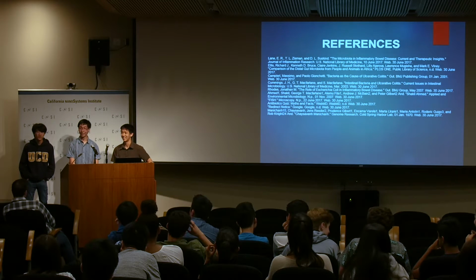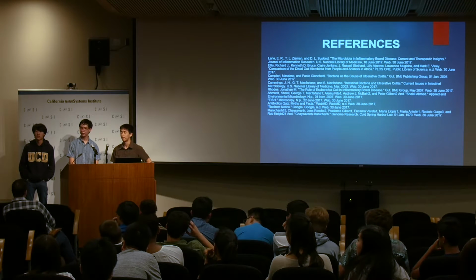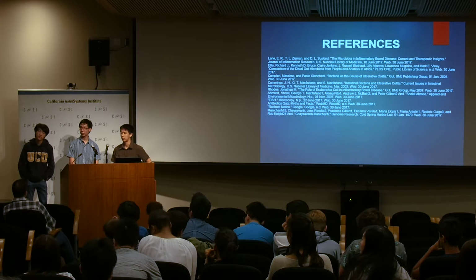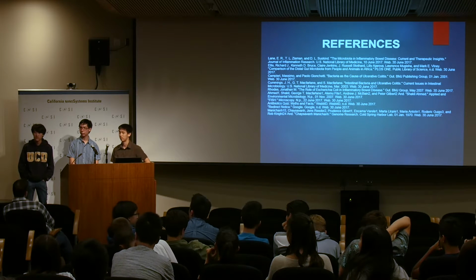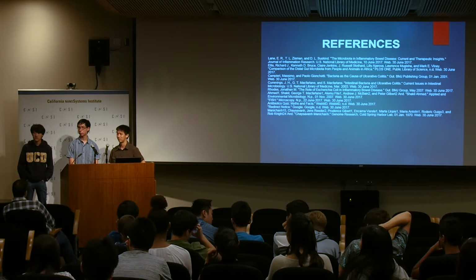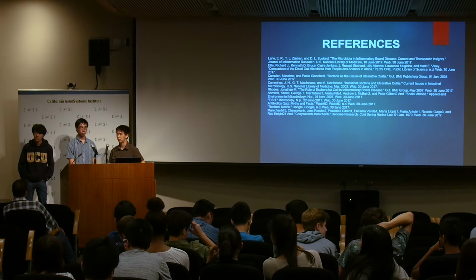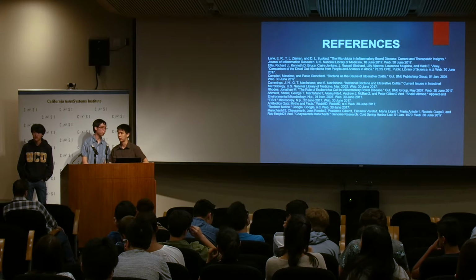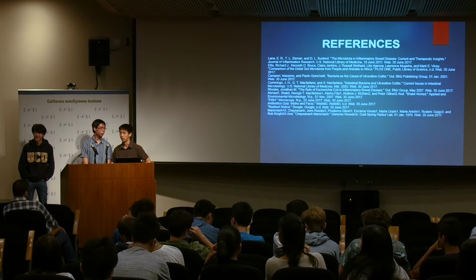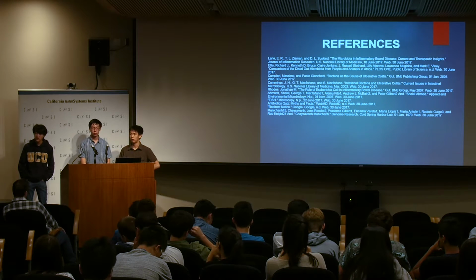Kind of. Right, the high throughput screening facility, right? So this is an area where we're addressing thousands, tens of thousands, hundreds of thousands of samples, right? Integrating optical detection, fluorescence detection with high throughput methods really allows you to address some of these bottlenecks. It's one of the reasons that we brought you up there, even though it's not a microscopy facility per se, it really overcomes some of these limits.